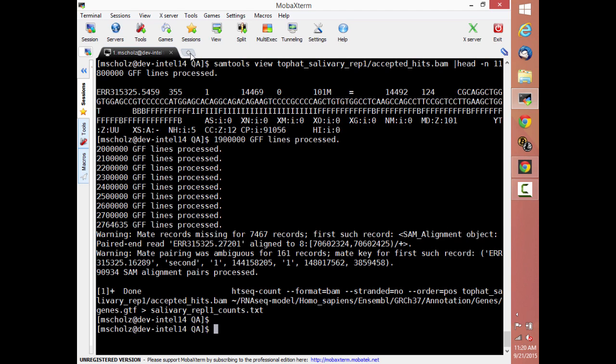And the reason I point this out is that the biggest danger you can have in RNA-seq, with high throughput anything, with large data sets, is for people to go expectation mining. Confirmation bias in reverse, if you will. I don't see the gene that I expect to be present. Redo the analysis until you find the gene. Bad idea. You need to find a pipeline that is going to work and give you results that you trust, and if the expected result is not going to match what your outputs are, then you need to determine whether or not you're right or wrong before you start looking at a different tool.